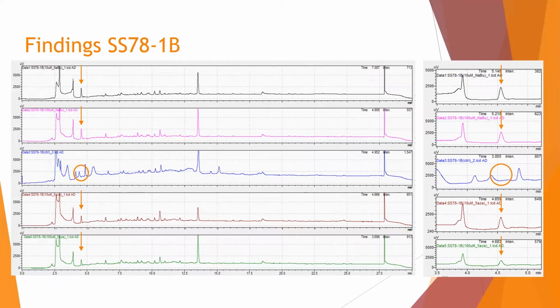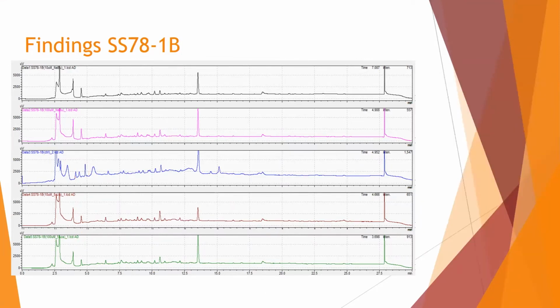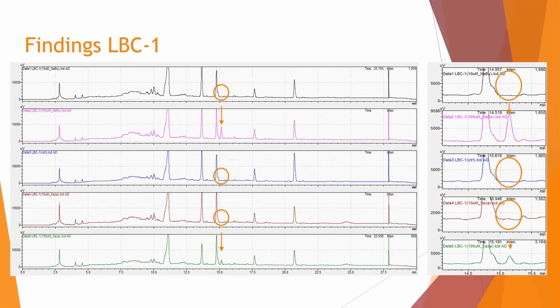So Dr. Harrison is asking, how do we know that that's not the molecule we use to treat our cultures with? For that one, I would like to look more at this one. If you're just asking about new peaks, both the new peaks should be the same in both, right? Since we had the treatment the same for the top two and the bottom two, just different concentrations, for that not showing up in the top one, it shows us that the thing you're treating with really didn't enter into it.